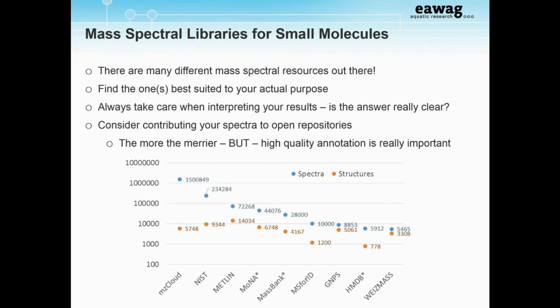With the high quality spectra, for instance, we do formula annotation so that we know that the peaks we're reporting in our database make sense according to their sub-formula, because we know what we start with. We've also done a lot of checks when we're curating, so we make sure that our SMILES matches the mass that we've extracted, that matches the identifiers that we've got in our MassBank record. And this is the way that you address it with the curation. For instance, some of the GNPS spectra, the substance behind it is the salt, which is not what you see in the mass spectrum. So if you calculate the mass of the compound, it doesn't match the mass of your mass spectra. Yes. Little things like that.